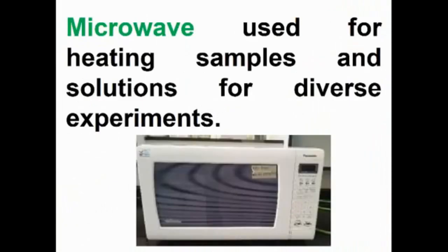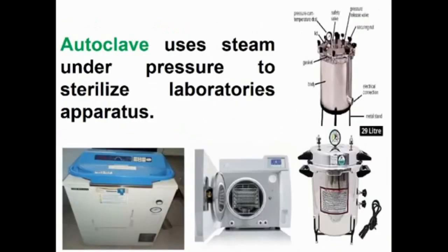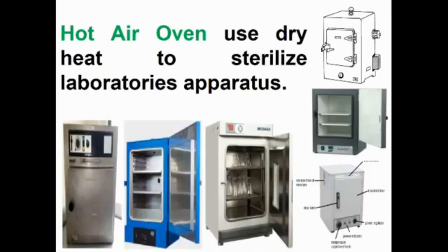Microwave, used for heating samples and solutions for diverse experiments. Incubator, used in tissue culture and microbial genetic laboratory purposes. Autoclave, uses steam under pressure to sterilize laboratory apparatus. Hot air oven, uses dry heat to sterilize laboratory apparatus.